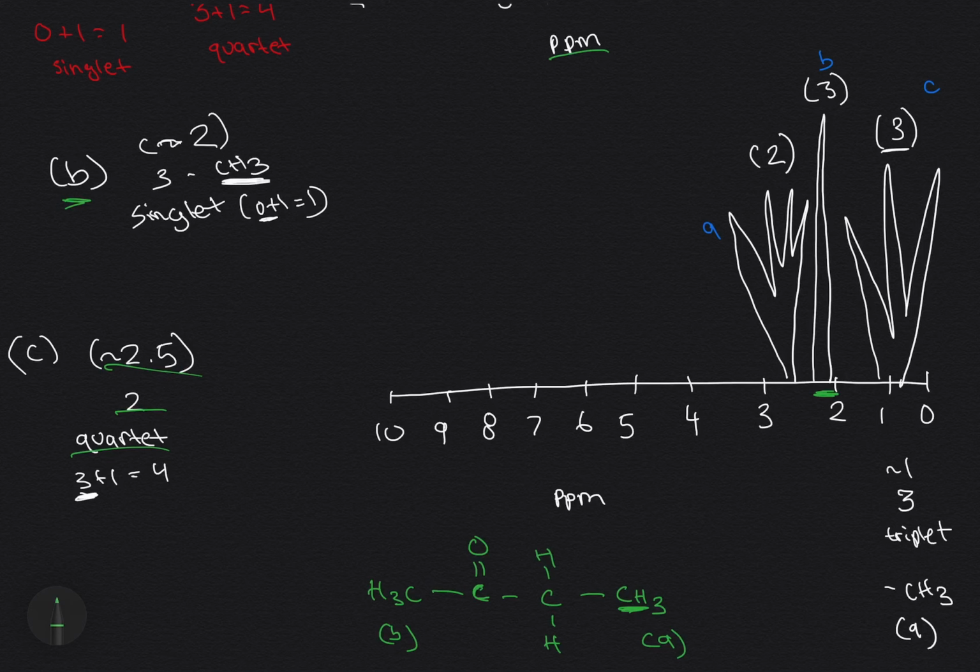So that's the way I like to go and address these kinds of problems. Just start writing down everything you know for each signal, and start constructing the molecule. It takes a little bit of critical thinking, but if you write everything out, you should be able to get at least a ballpark. You should be able to get the right answer, or hopefully at least just get close.